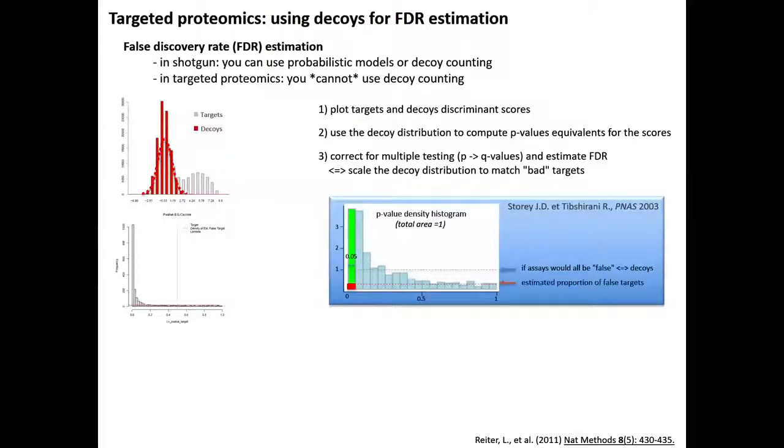And here, how you identify the level of false positives is by stretching out these asymptotes. When you see the p-value flattens out at this level, from here on you can be pretty sure that this is the level of p-values that match only false positives, and you can extrapolate and calculate the number of p-values that you have in your first distributions.